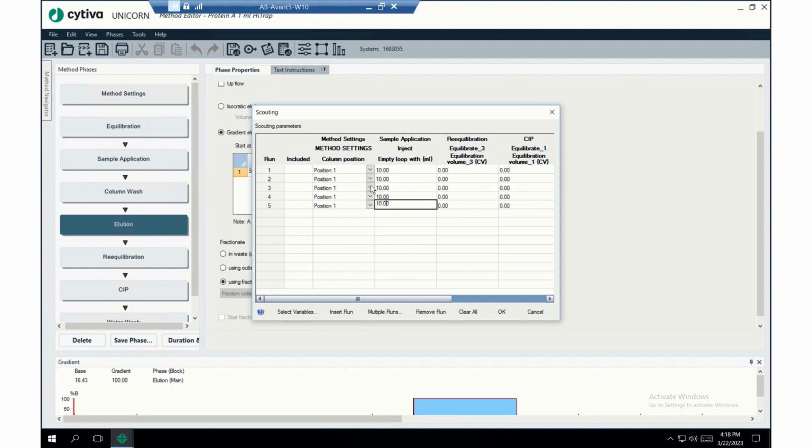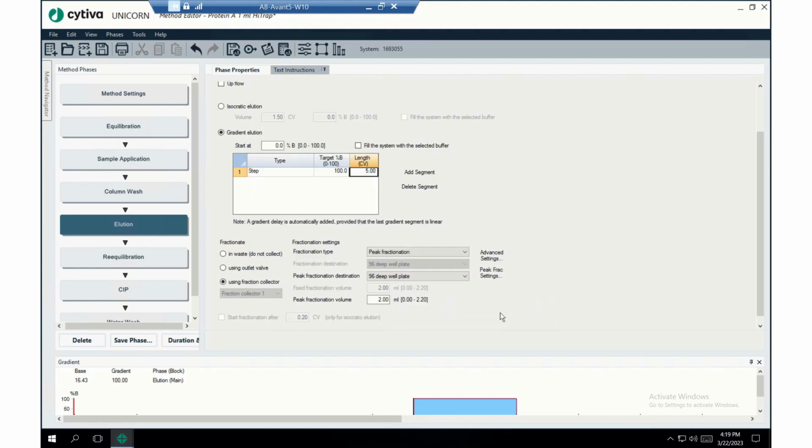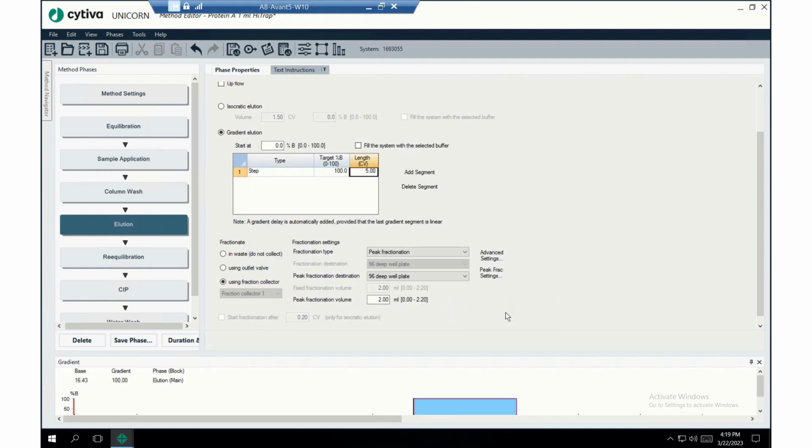Okay, there we go. All right, so for the 5th run, that's when we want to do the clean in place. So here we're going to make sure it says 3, 3, oops, not 30, just 3, 3, and 3. Okay, that's it. Other than that, let's see what it looks like. Let's just open it again just to make sure everything's saved properly the way we want it. Sometimes I wish it had a save button in here or something like that.